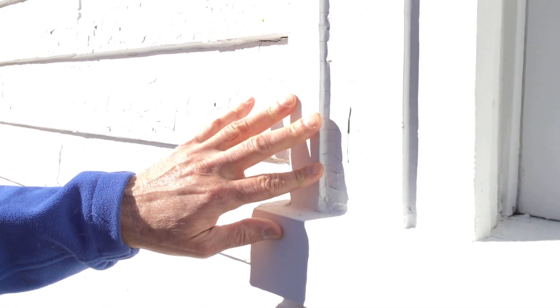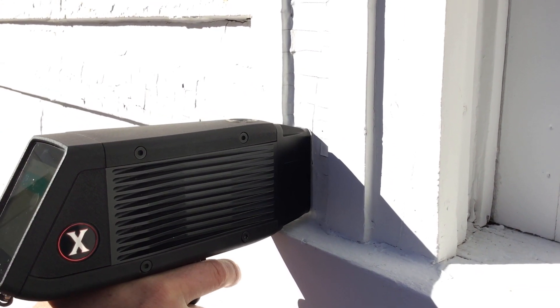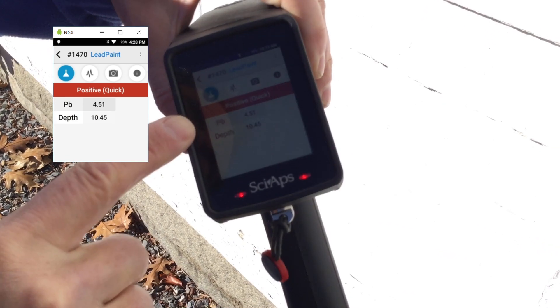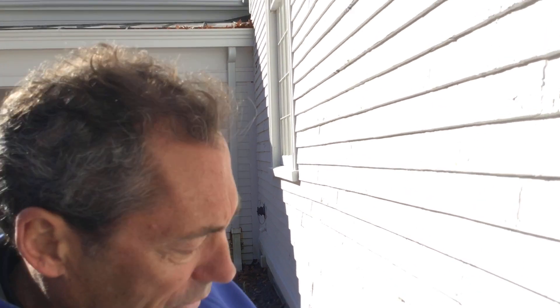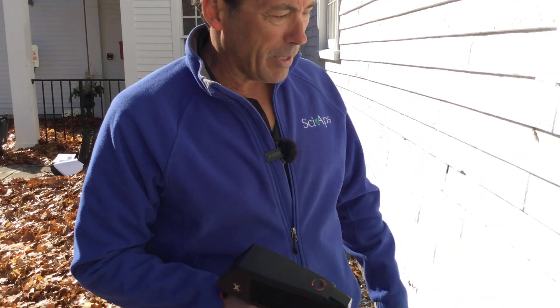See this right here — see how cracked and thick that is? Let's take a couple of shots there, right on that thick stuff. That was a really fast test. That was test 1470, really fast because the lead is high — it's up almost 5. That was like a one or two second test, very thick paint though. That depth factor of 10 — that's probably 50 or more coats of paint. What we're showing here is this thing gives good, accurate results on real-world paint, just like the PCS test.